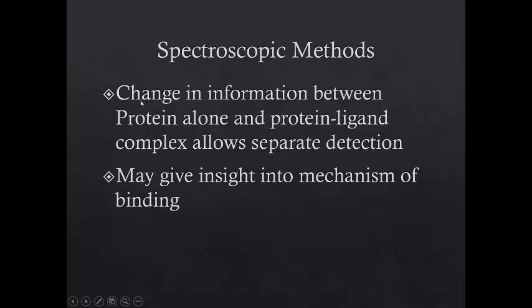Here's where you use light to look at the change in information between the protein alone and the protein drug complex, which allows you to separate the detection of the bound versus unbound drug. So that's it. All right, we're going to do problems next.